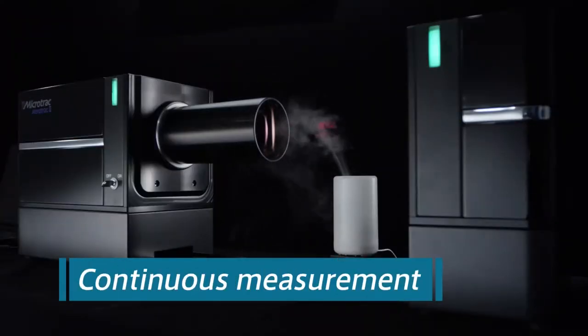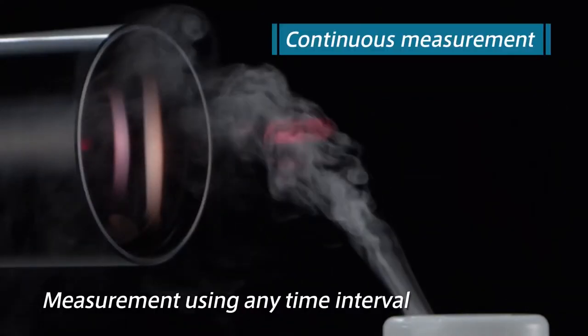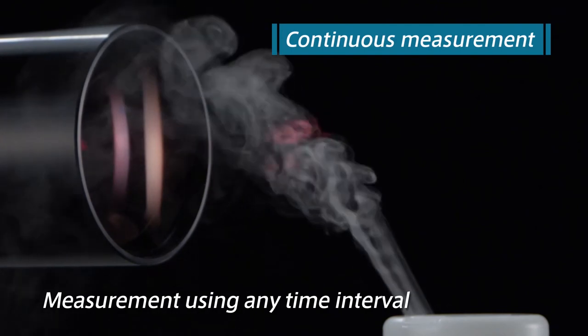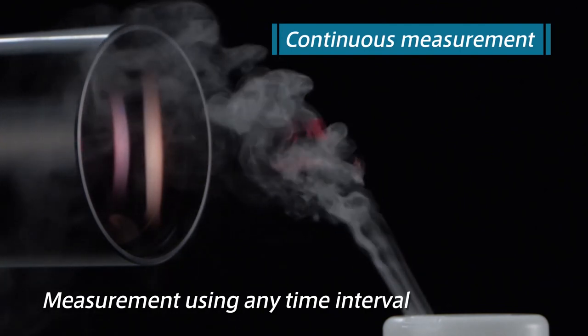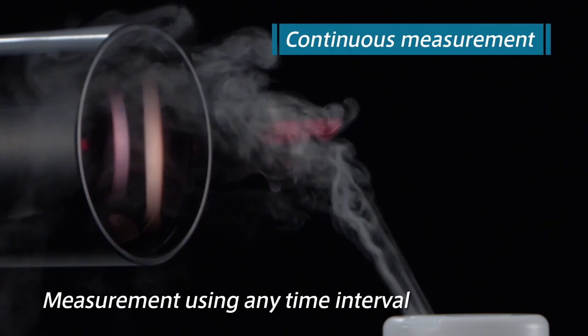Continuous measurement. The continuous measurement mode enables repeated measurement using any time interval. Continuous measurement is perfect for evaluating long-term product stability.